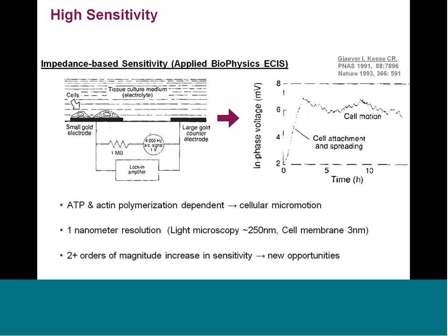What you should expect out of that is not only label-free, but a lot of new opportunities. And I mentioned one of those was GPCRs for the CellKey, but certainly this kind of sensitivity should be easy to detect beating cardiomyocytes. Should have sensitivity to spare.